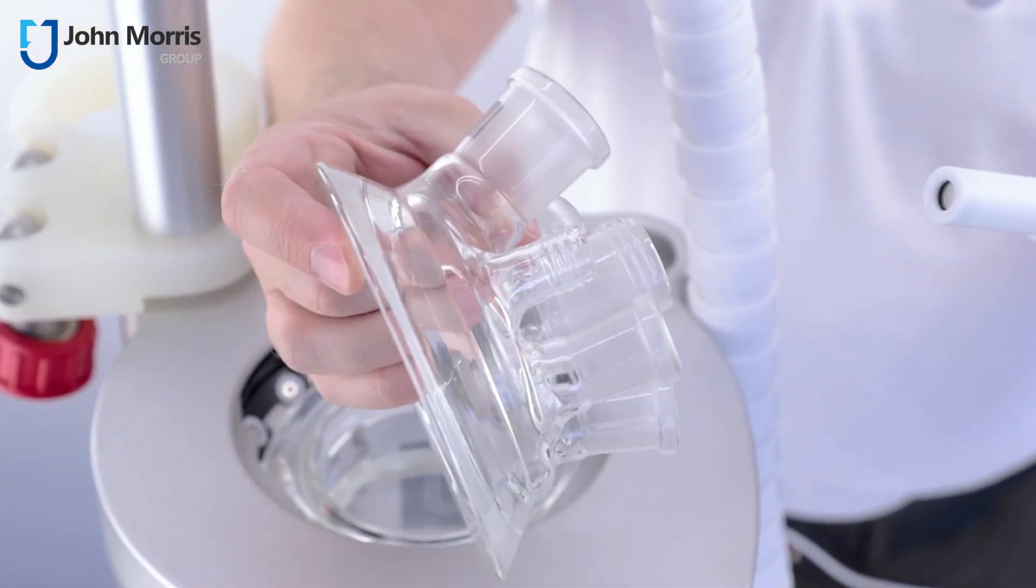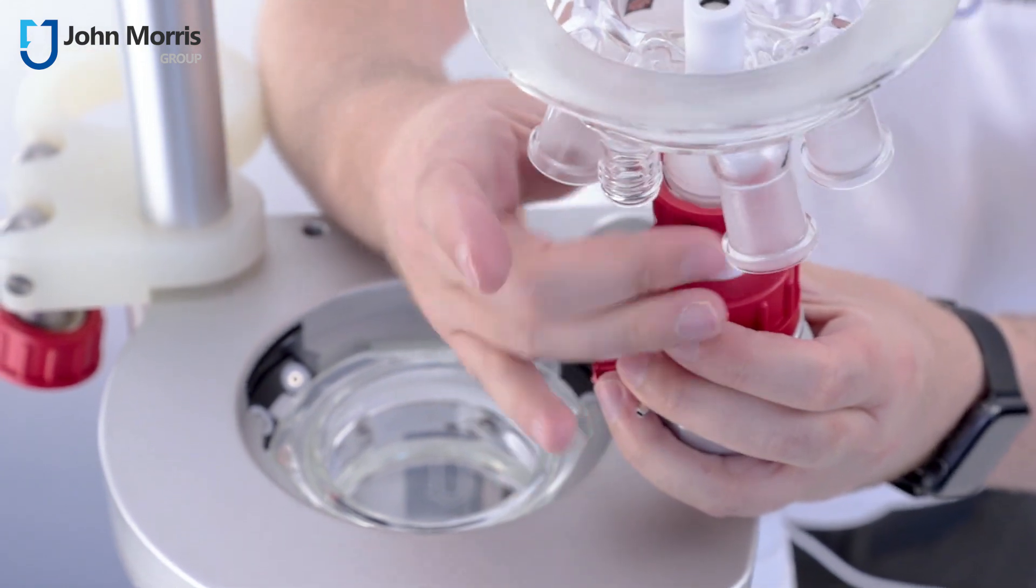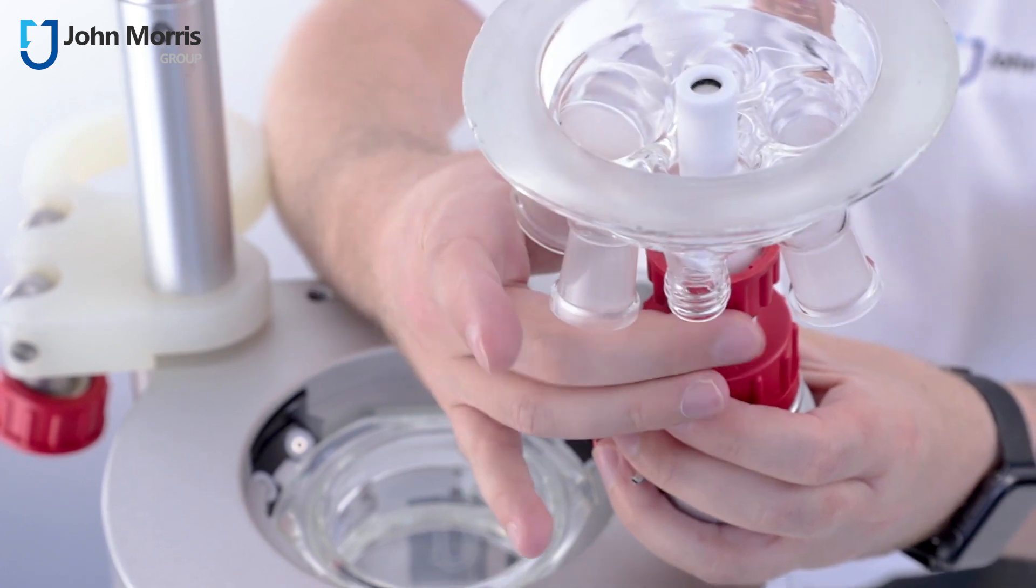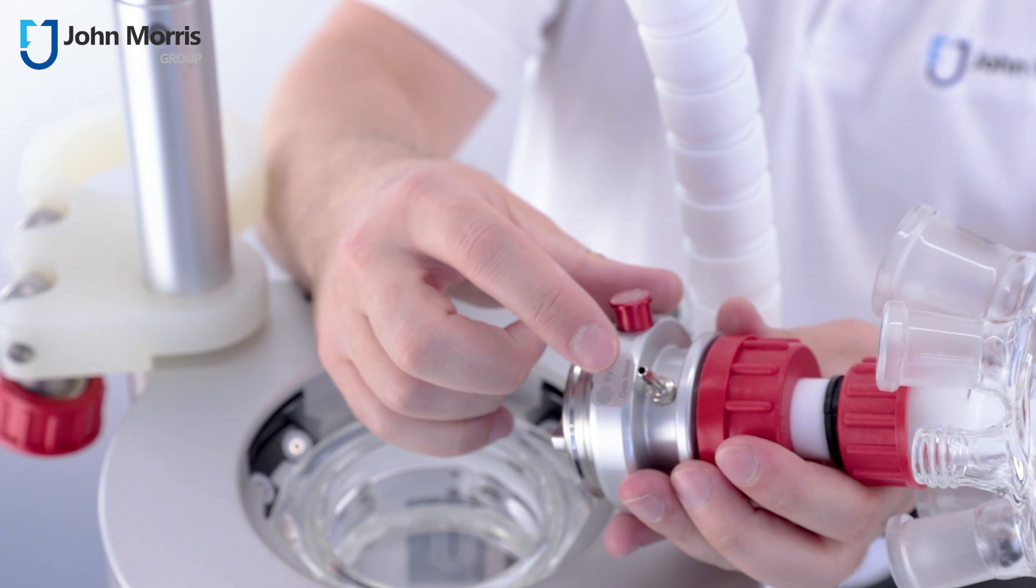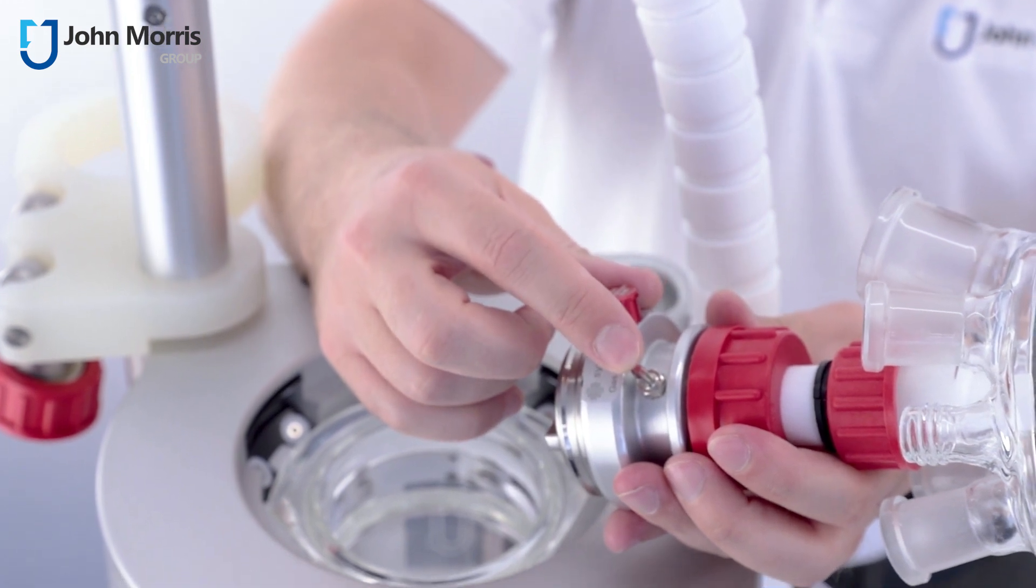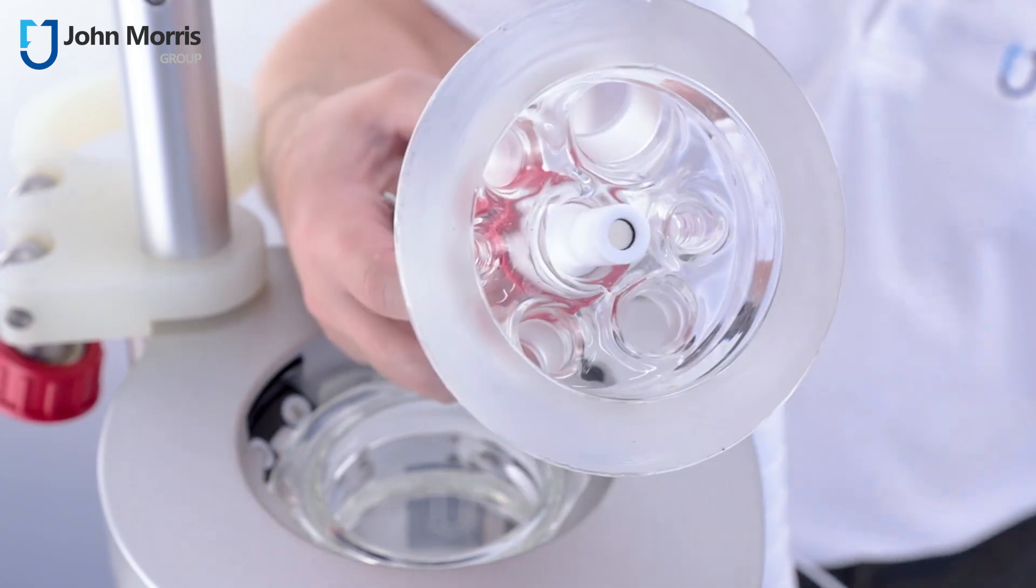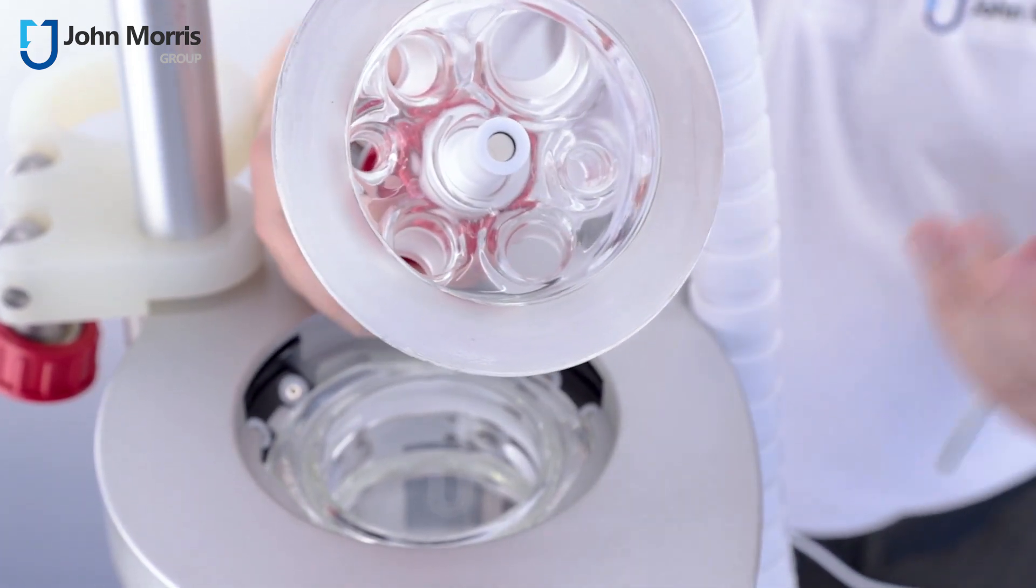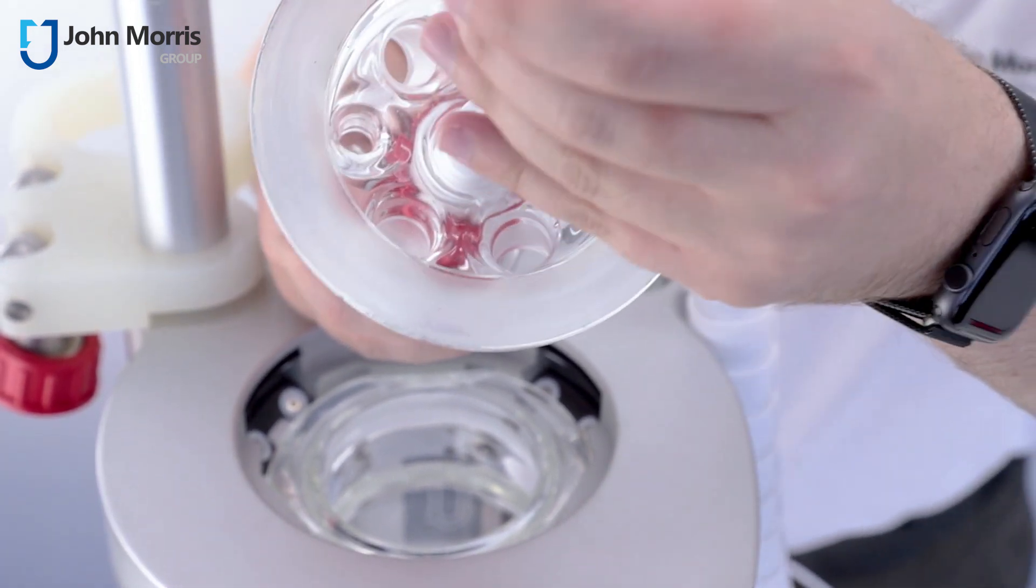To connect the stirrer to the vessel, slot it in like this and tighten it like so. You'll notice there's a port right here in case we want to put in inert gas, and to connect the stirrer at the end of it there are a range of different kinds of blades straight through.